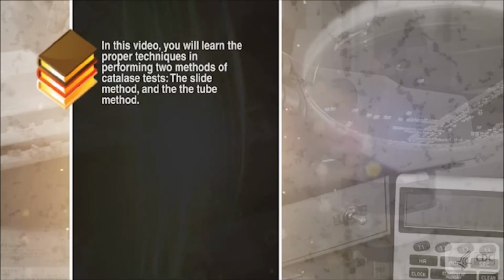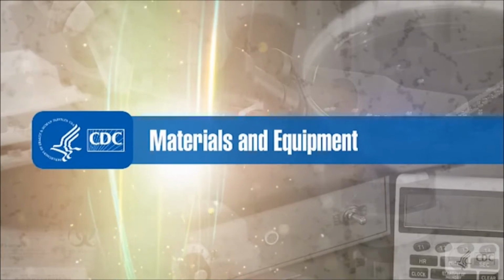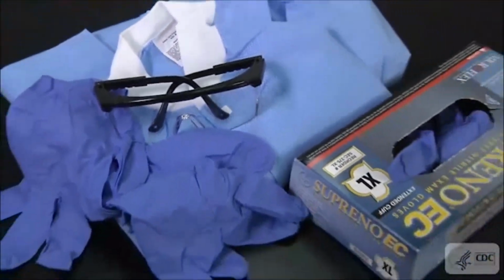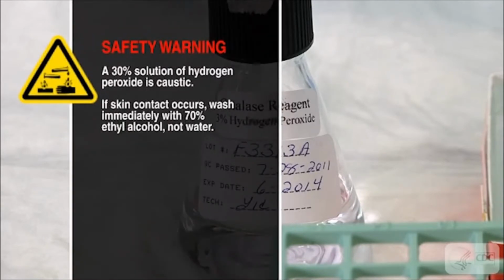In this training program, you'll learn the proper techniques in performing two methods of catalase tests, the slide method and the tube method. For these procedures, you will need the following: personal protective equipment and hydrogen peroxide. A warning about hydrogen peroxide. A 30% solution of hydrogen peroxide is caustic. If skin contact occurs, wash immediately with 70% ethyl alcohol, not water.